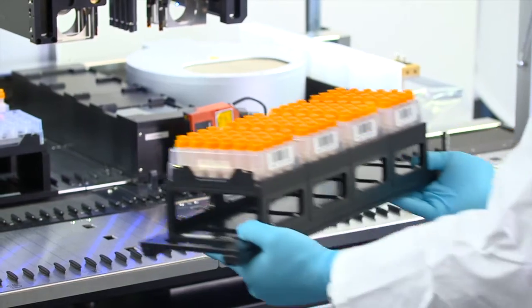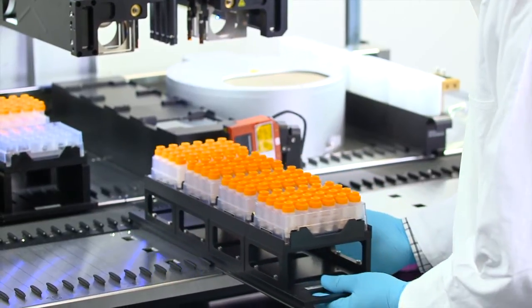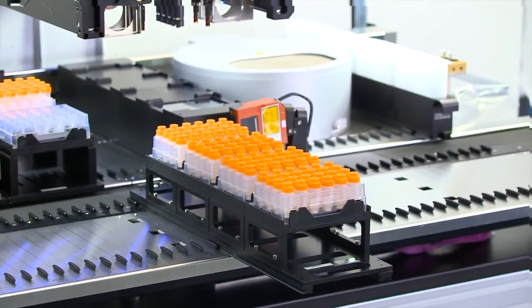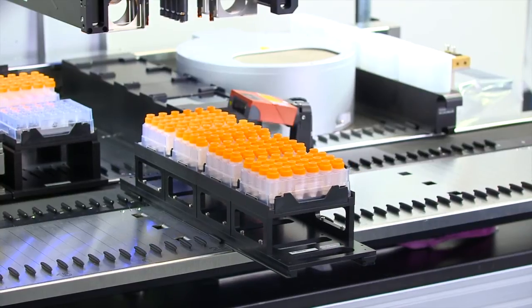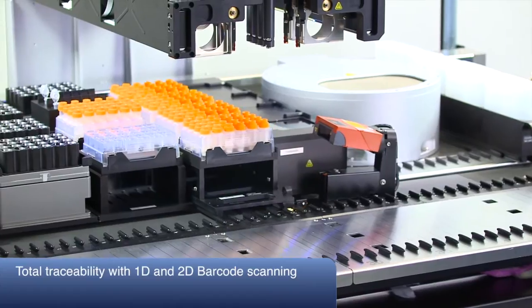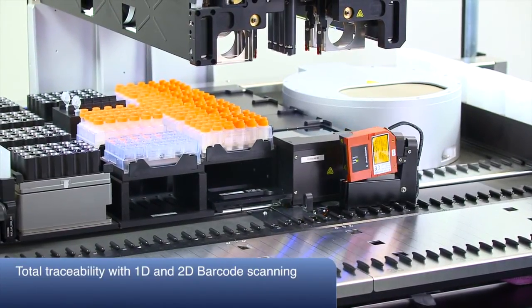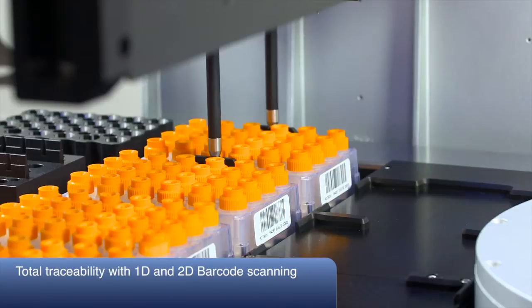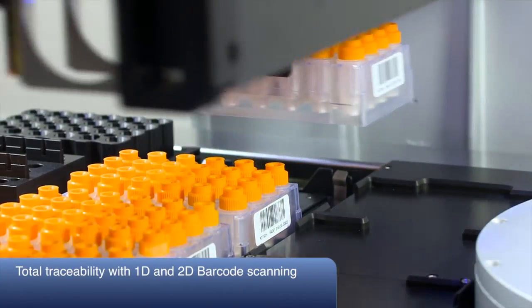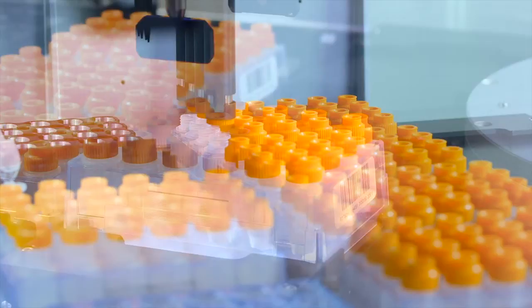The Autolis tubes are placed in the Autolis racks after manually inserting the raw samples into the tubes and matching the evidence sample barcode with the Autolis 2D barcode. When loading the Autolis racks on the robot, the autoload barcode reading ensures a high level of verification to prevent possible human error. The EasyCode 2D barcode reader will identify and verify the individual Autolis tubes.